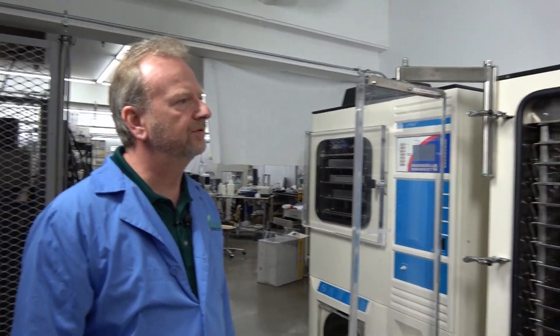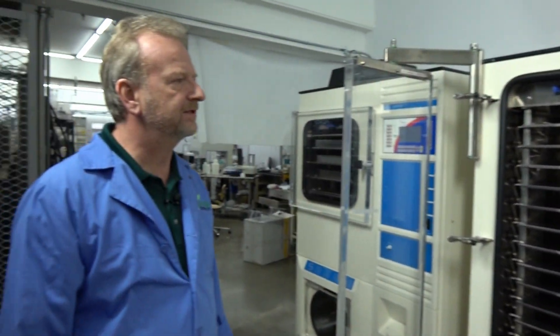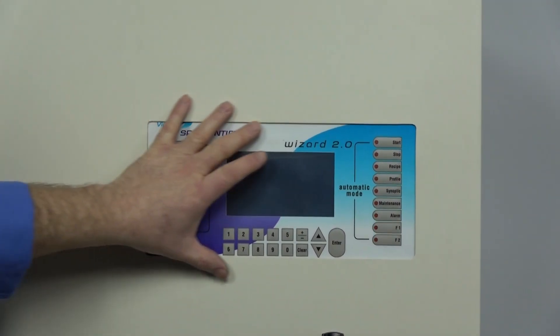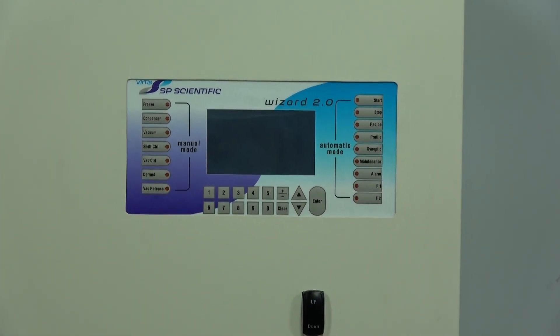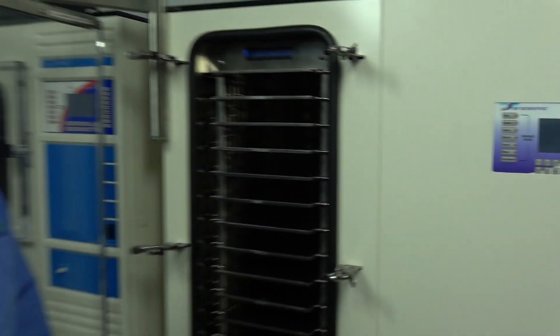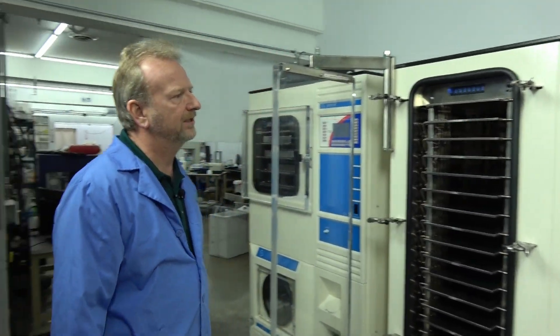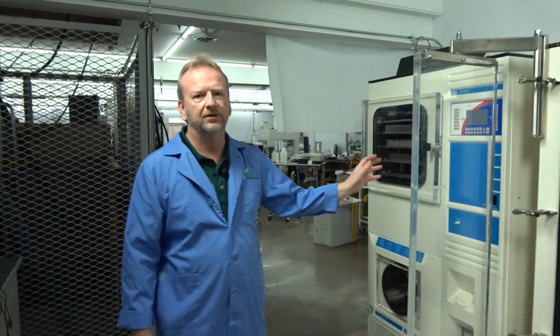We are now converting these Ultras over to the new Wizard 2.0. It's as simple as cutting a slot in the front panel, inserting the control panel, doing all the wiring, and hooking it back up to replace the older system. It works great — once you get used to it, you don't have to change it; you can just upgrade and move to the next system.